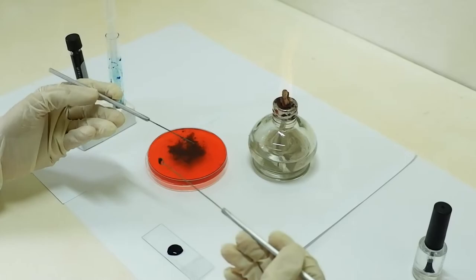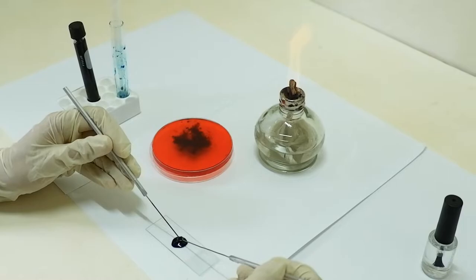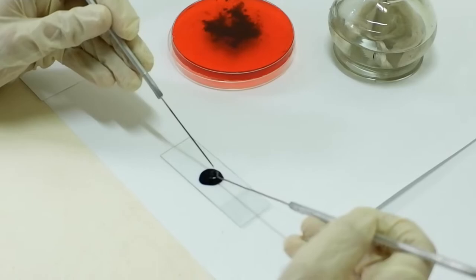Place the fungal portion in the LPCB and with your second needle, tease apart the hyphae so that they form a thin layer.